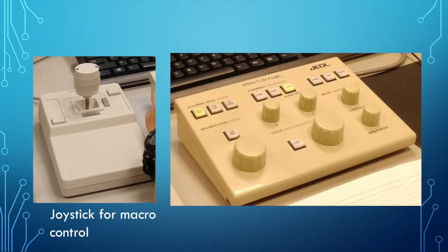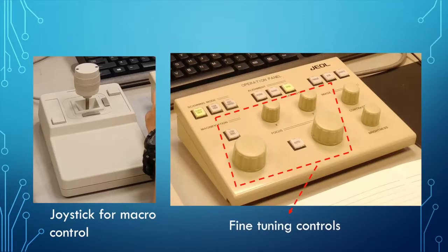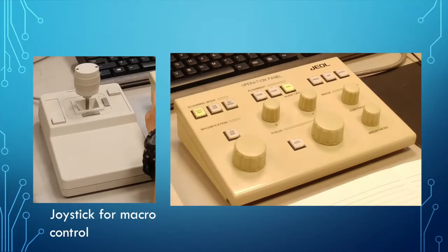Aside from the SEM machine itself, there is also the control panel and joystick used to control the SEM. The more important feature that is mainly used would be the control panel, where you can fine-tune the focus of the SEM on the sample. On the control panel, it contains the freeze button as well. It allows you to freeze the image and save for viewing later.